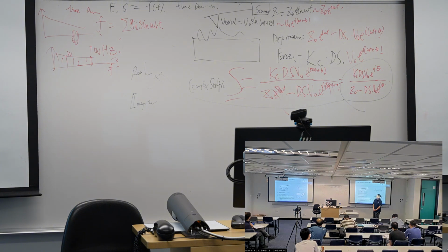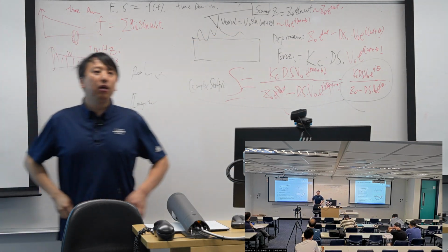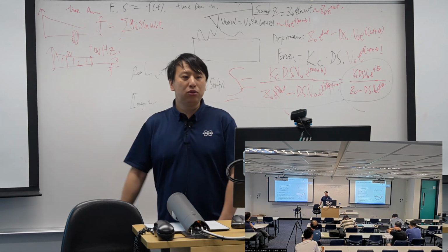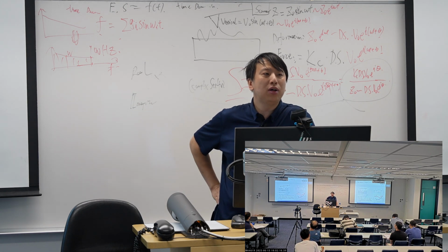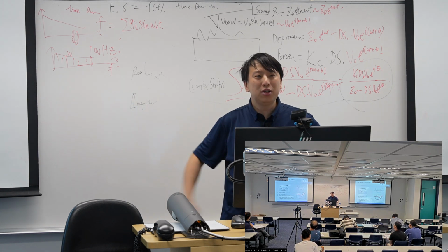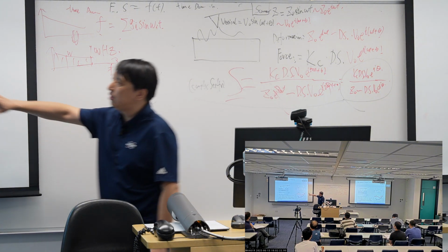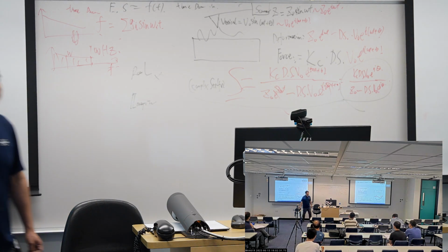That's the same game. So that's why in nanoDMA we mostly need to use a defined shape, unlike QNM or force spectroscopy, where a random shape is okay and we can use the relative method. For this one, we prefer a fixed shape. As such, the AC will be fixed.